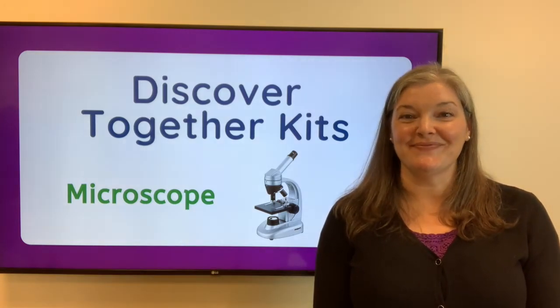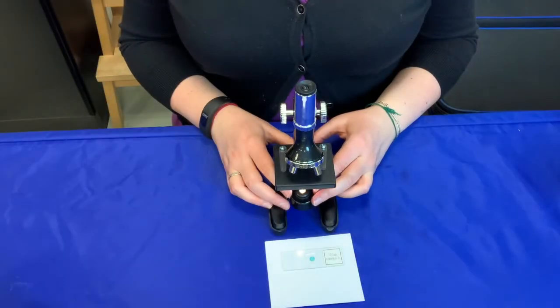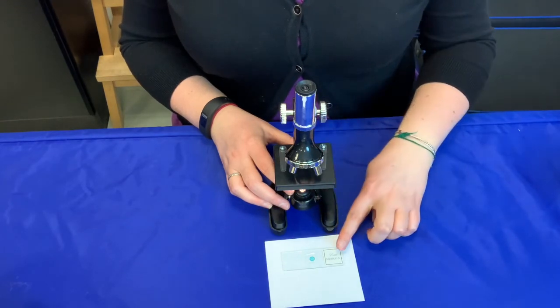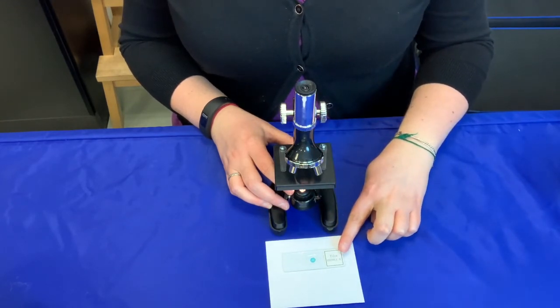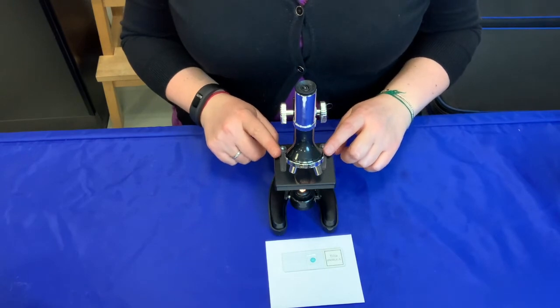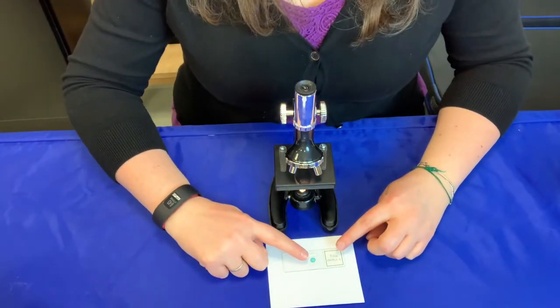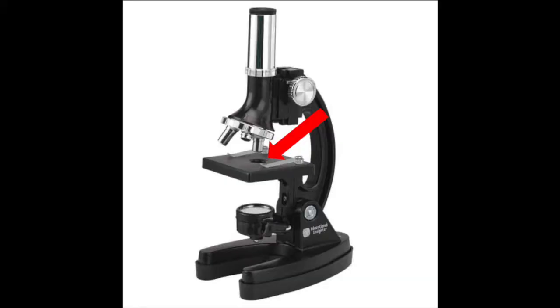Let's get started. After you've aimed your light source on your microscope by either adjusting the mirror or using your light source, choose one of the prepared slides from your kit. Place it under the two spring clips on top of the stage. You want to make sure that this colored part of your slide is on top of the circular hole in your stage.